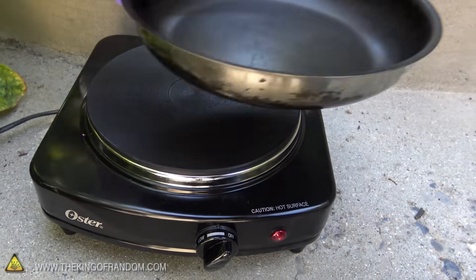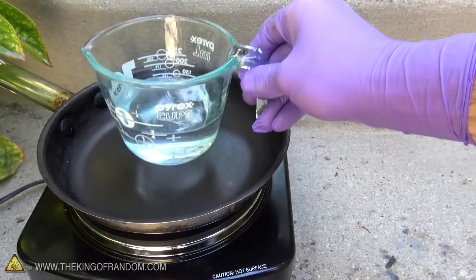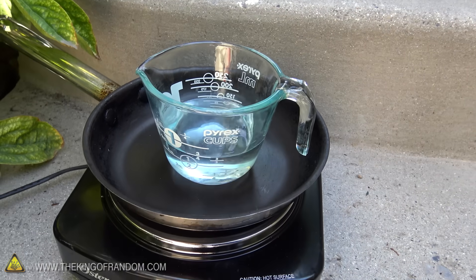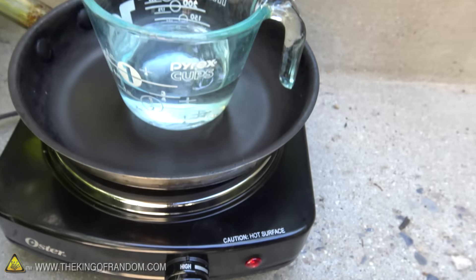I picked up a little burner here, it was about 20 bucks. I'm going to stick a pot on there just to help collect any spills, and then set our Pyrex container of sulfuric acid right on top. Let's crank this up about as high as it goes — that's only going to reach about 100 degrees Celsius because the water will start boiling off.